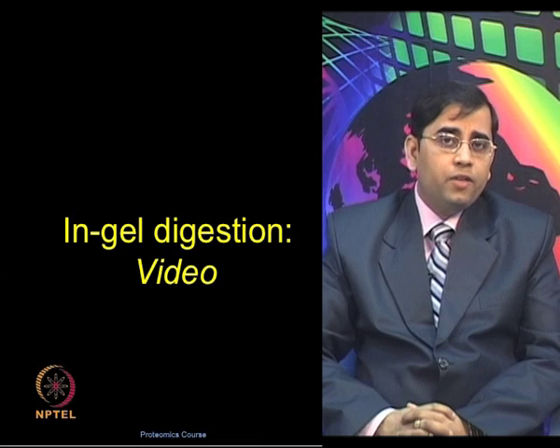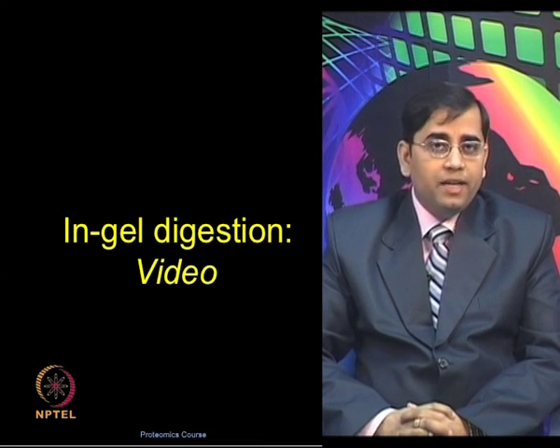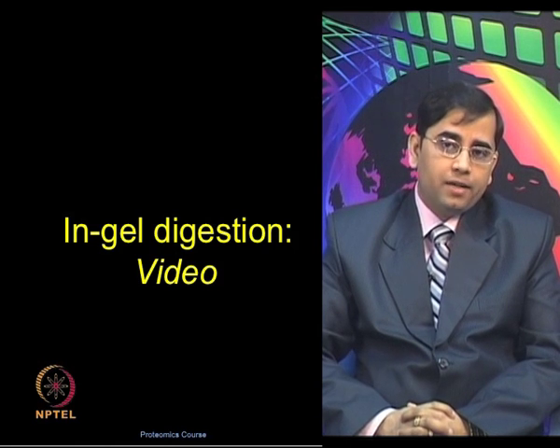However, the recipe is very flexible and varies from lab to lab to meet the specific requirements of a particular proteomic experiment. The in-gel digestion procedure is compatible with downstream mass spectrometry analysis, whether you want to continue with MALDI-TOF or LC-MS based analysis.